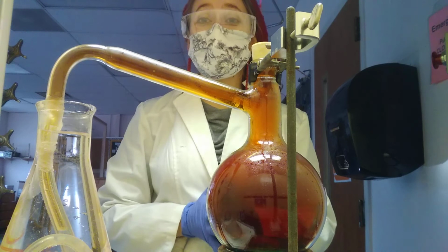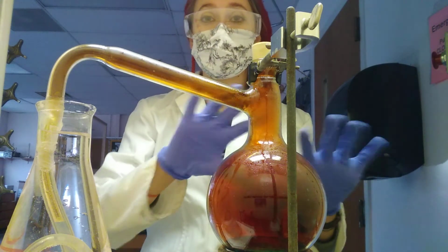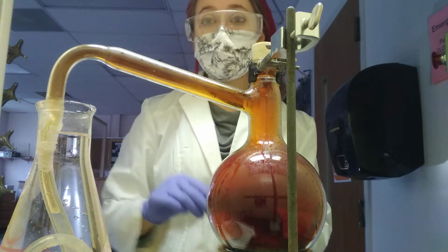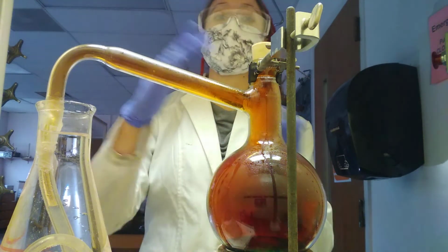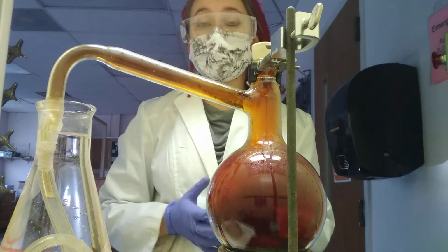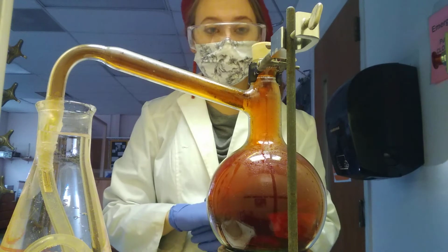What I would like you guys to do is start a second drawing. You can just go ahead and start getting your basic outline of the round bottom flask and the Erlenmeyer flask, because when this happens, I want you to do a second drawing and make a second set of observations of what happens as it's slowly being pushed this direction.